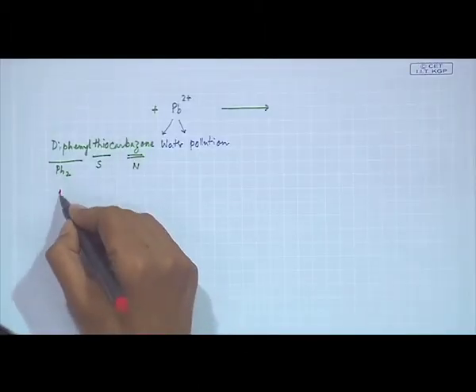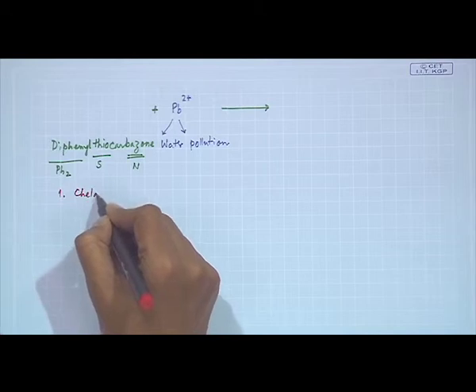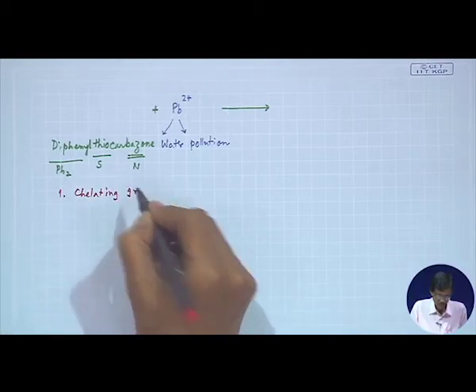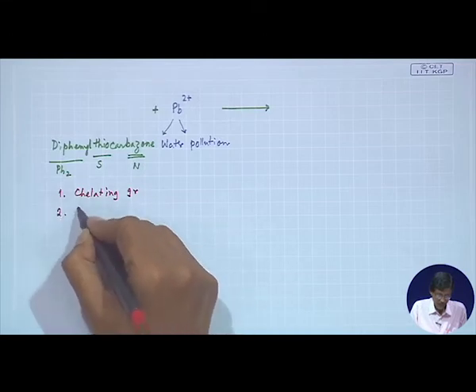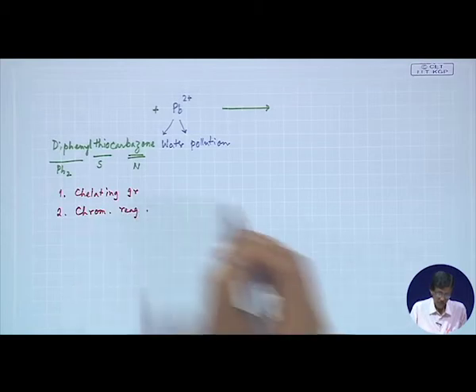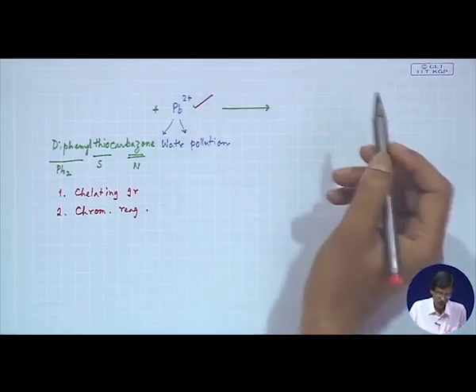So, it is basically the chelating group, as well as a chromophoric reagent to determine the unknown concentration of lead 2 plus.